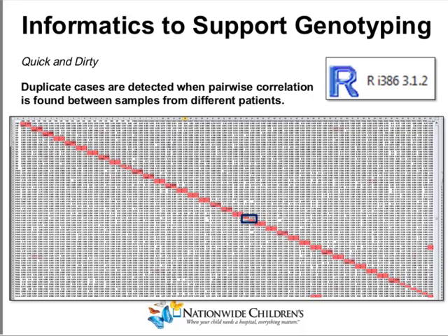I'm actually just showing you a zoomed out view of the last two slides, where here was the first set, here was the second set that has the mismatch. And so to find the historical matches, you're looking for high correlation off the center line. So anywhere out here, if there's a sample that has a high correlation with another sample, that would suggest it's a genotype match. This real set of samples did not have a historical match. But as a control for this process, I introduced a mismatch that is up here.